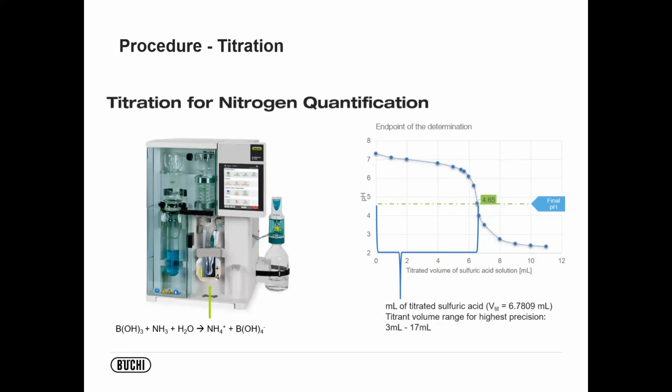And then going a little bit deeper onto the titration. I know we all took high school or college chemistry, so this is something we're all familiar with, but just know that the technology within our instrument, and this is common throughout the market, is going to be performing all these calculations for you in the case of automated Kjeldahl. So no more handwritten calculations. All this will be calculated for you, and it can be uploaded into your LIMS system, or however you have your instrument wired into your organization's network.